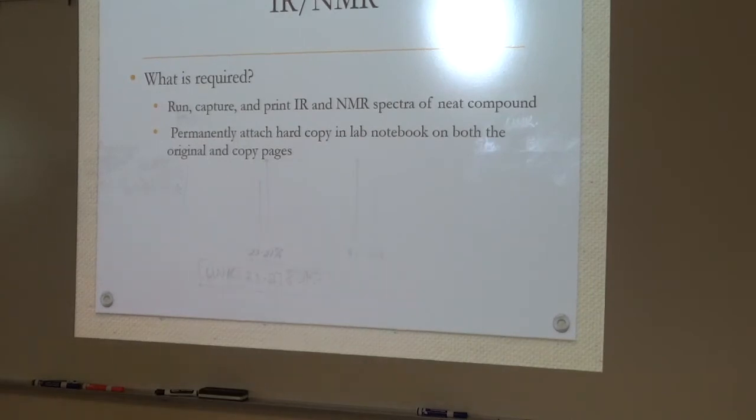You're going to permanently attach the hard copy that you print out into your lab notebook. You're also going to need a copy that you're going to permanently attach on the copy pages. That is the only time the IR gets affixed into your lab notebook. After today, if you're running an IR, it's because you've made a liquid product. You're going to run, capture, and print it, but then you're going to turn it into me so that I can reference it while I'm grading products.